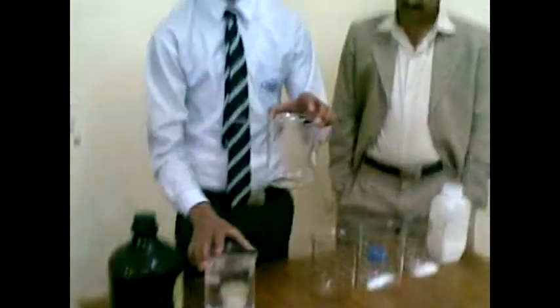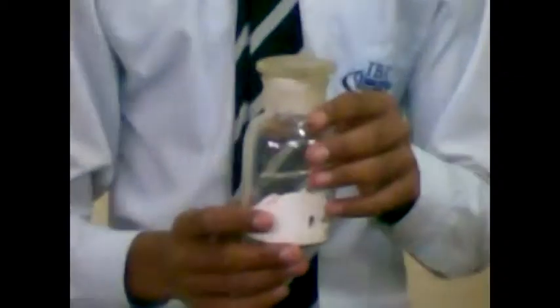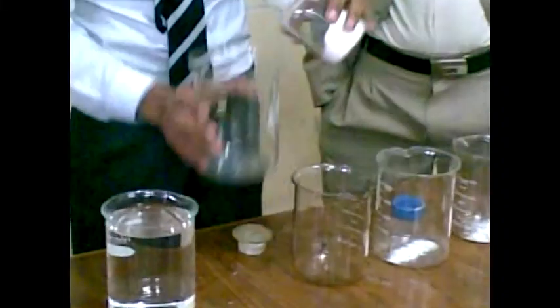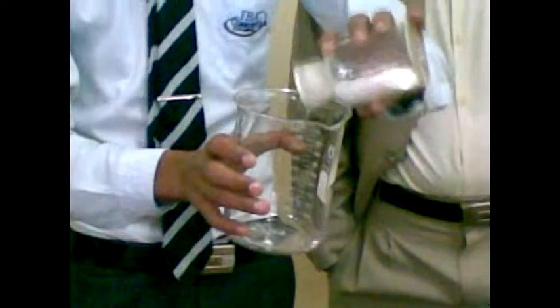And now, in the second beaker, I used sodium carbonate. The formula of sodium carbonate is Na2CO3. We used a little amount of sodium carbonate because it is a simple experiment.